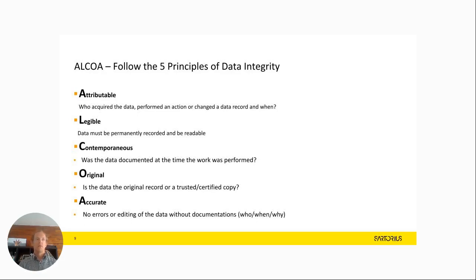The third point, contemporaneous, not my favorite word, excuse me. Was the data documented at the time the work was performed? So isn't there a time change? Can you change the time? Hopefully not. Original: is the data the original record or a trusted copy, or did someone go into a file and change something?